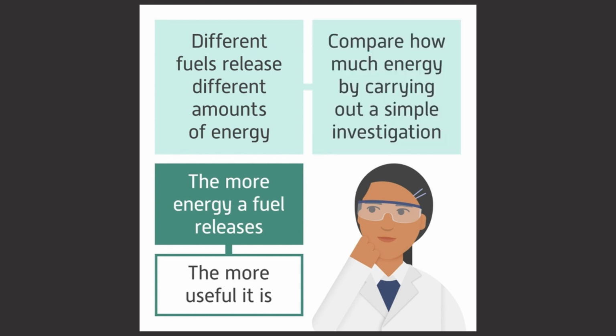You can compare how much energy different fuels release by carrying out a simple investigation. In this pod, we'll look at how to perform this investigation properly.